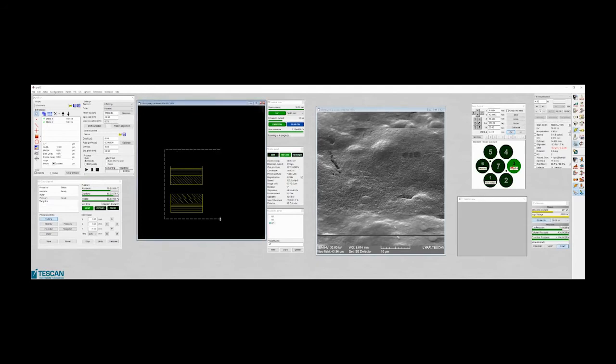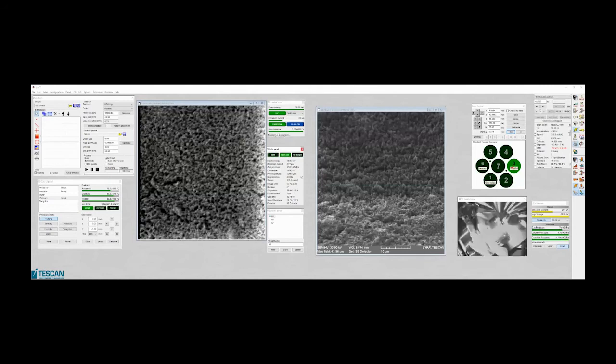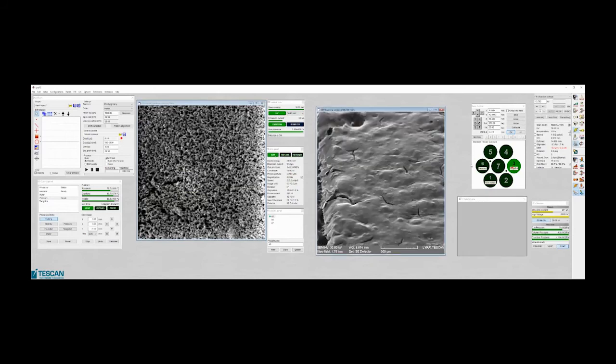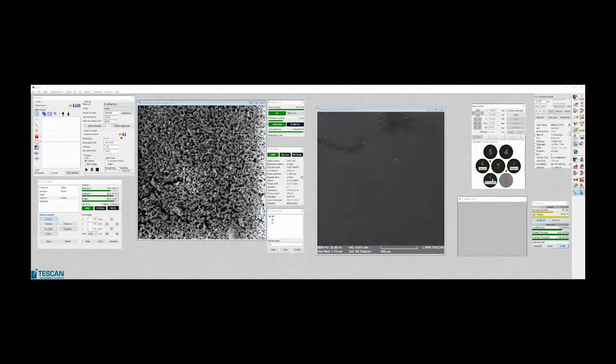So I will place there a smaller aperture. Oh, it's running something. That way we will have better resolution. Okay. And I will move from this material science. I will move to tissues.